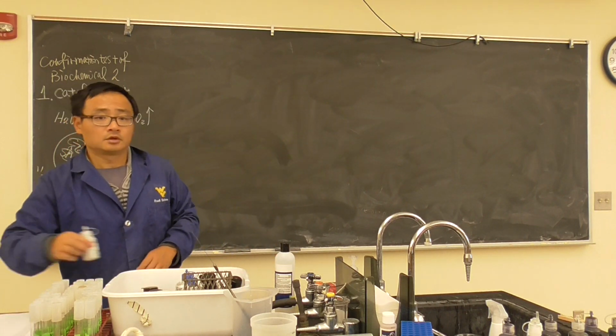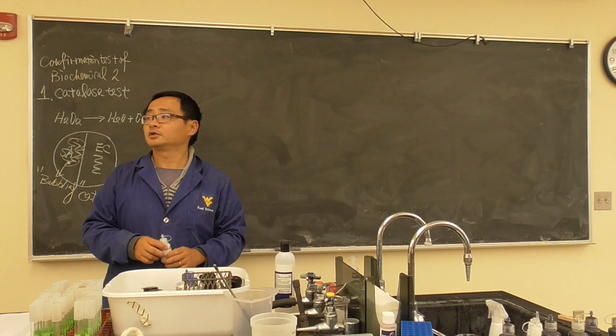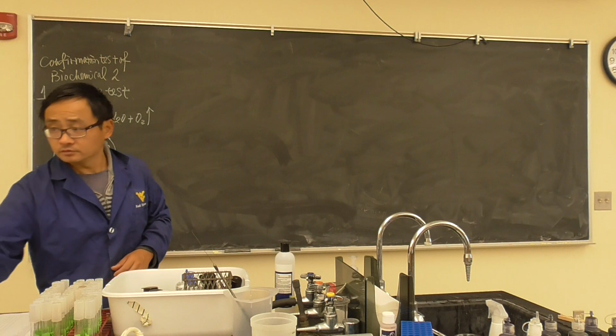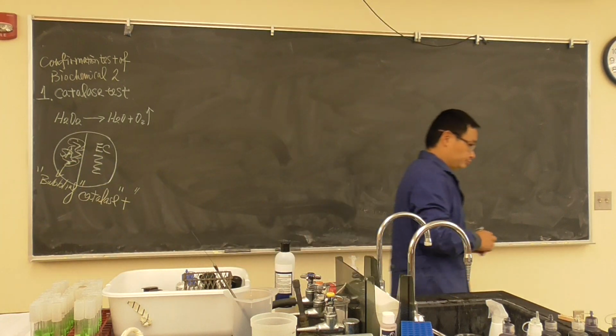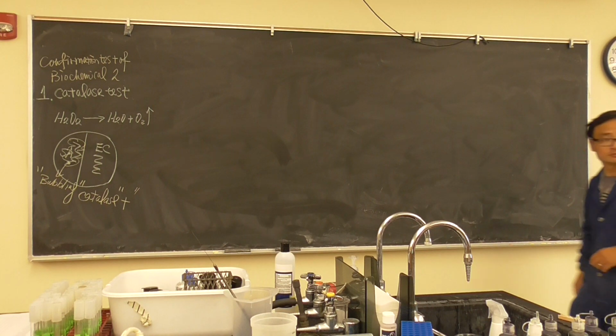So what we're going to do is, Jess, you're doing that. Just a couple of drops is enough. Yeah, it's working great. Have your plates ready? Okay, I'm going to give it to Corey. You're going to help everybody else add H2O2 onto the plates. That's your job.